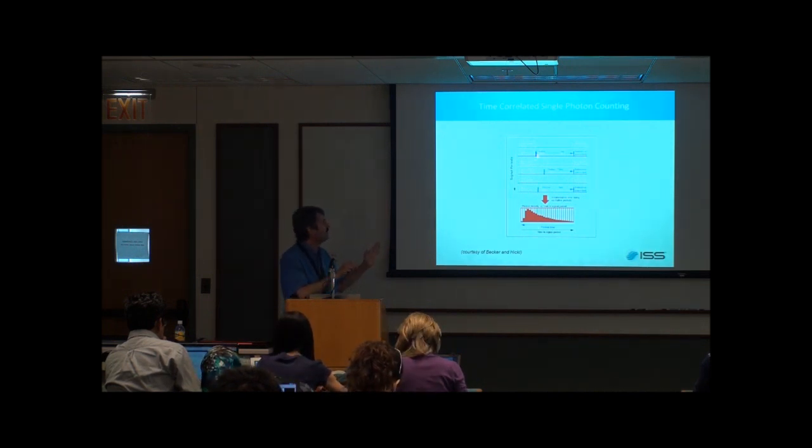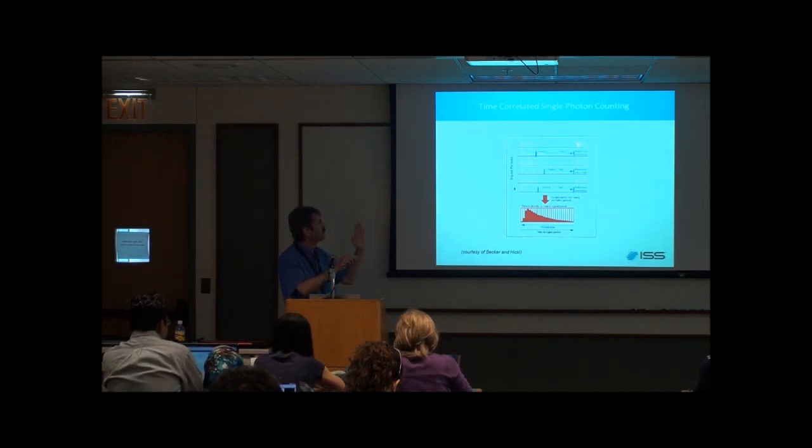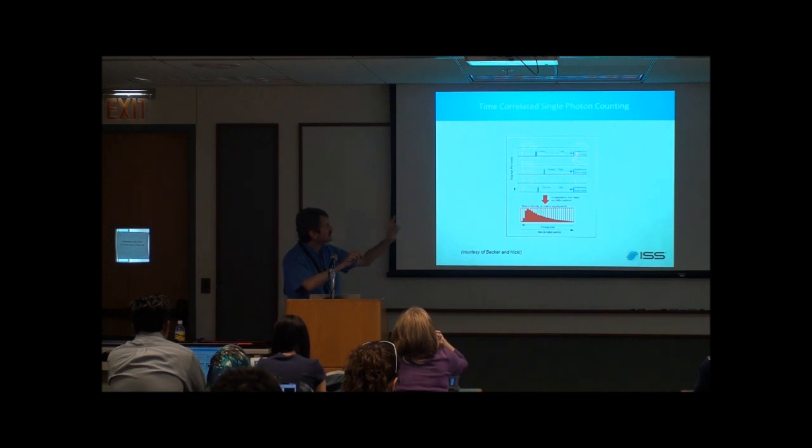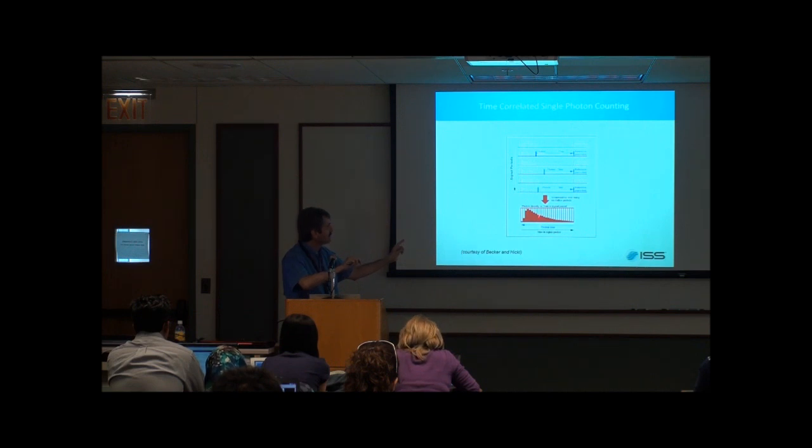So in time domain, we have pulses coming from the laser, one pulse, another pulse, and they continue. And there is a photon coming, and the instrument records the time between one photon and the next pulse coming from the laser. We take this time, we build it, we place it here. The second photon is a different time, shorter, it will finish up here. The third photon is in the middle, it will finish up here.